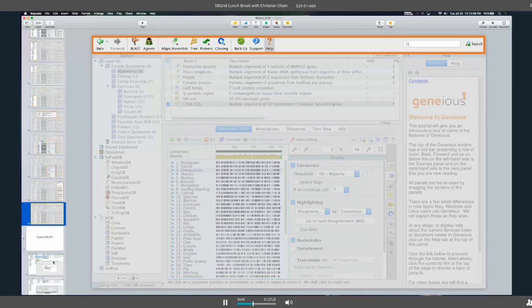As well, the green backup button to the left of that, that makes it very easy for users to back their data up. And I cannot stress this more. Please get on a backup schedule. This is probably the number one support ticket we get. If a database corrupts, which happens, and you've not backed up your database, then you're stuck. And so if you can set a calendar alert to remind you to back your data up once every 2 weeks or at whatever interval you feel best, please use that backup button. Okay.